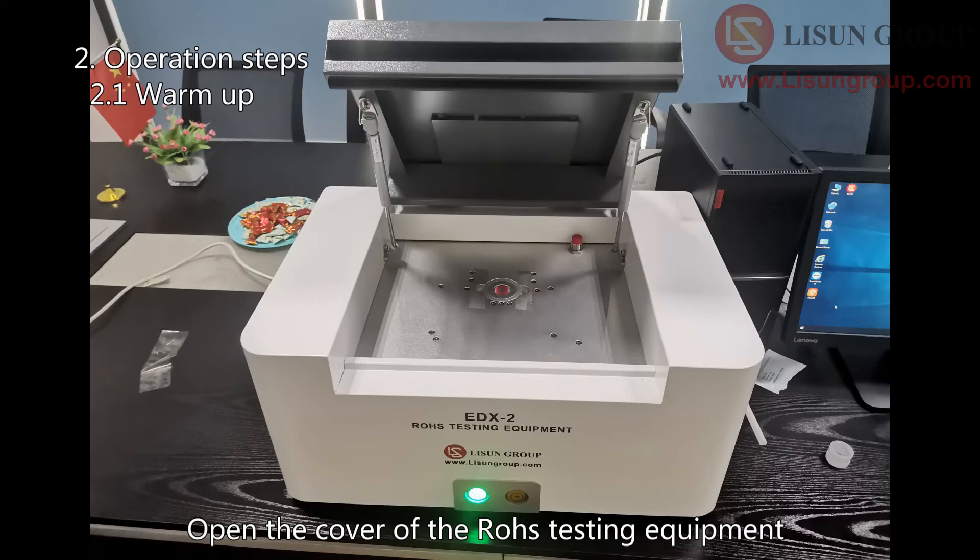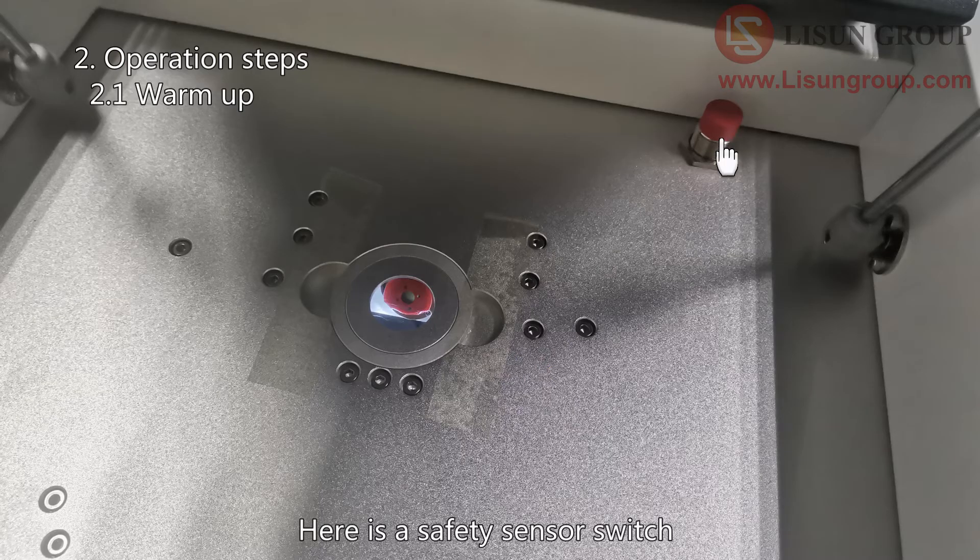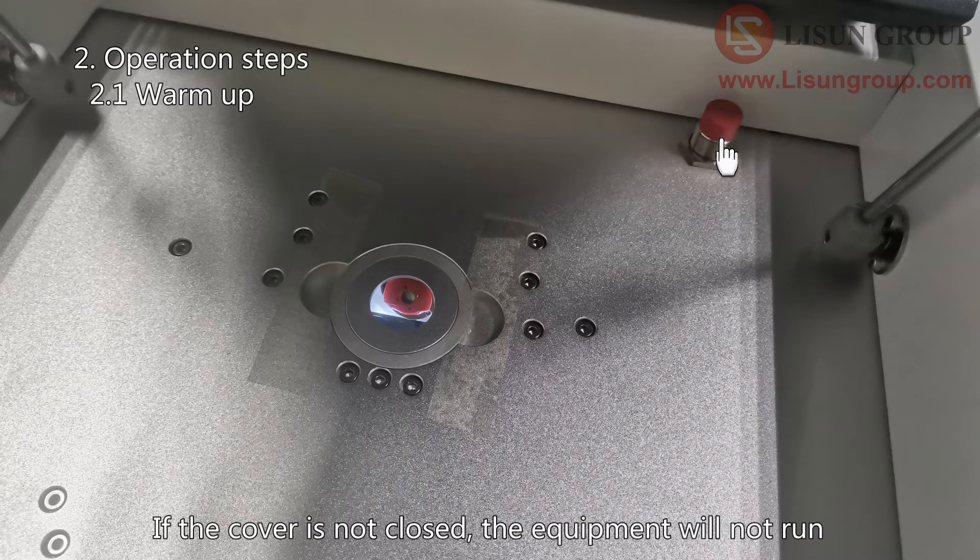Open the cover of the RoHS testing equipment. There is a safety sensor switch here. If the cover is not closed, the equipment will not run.